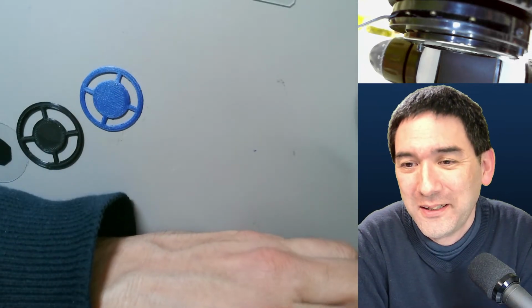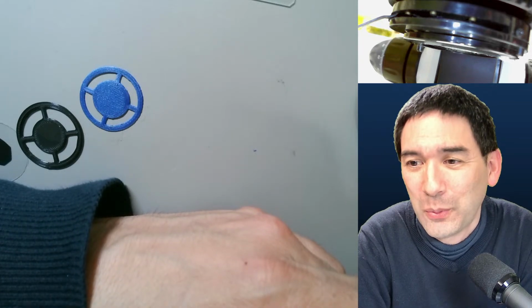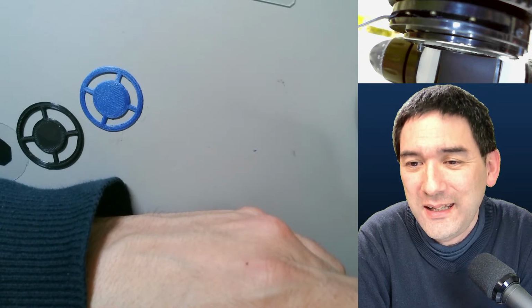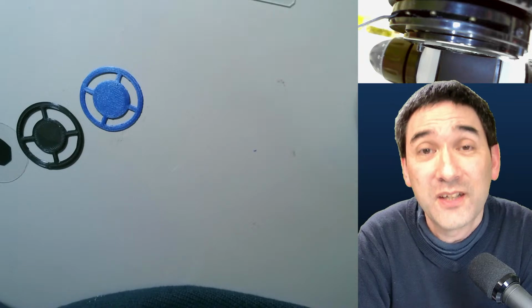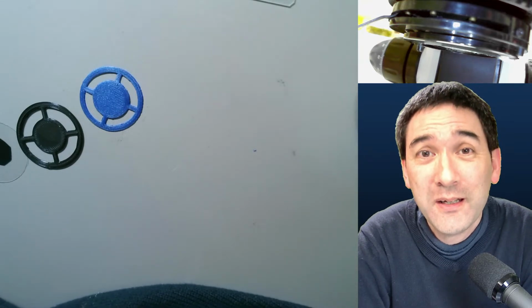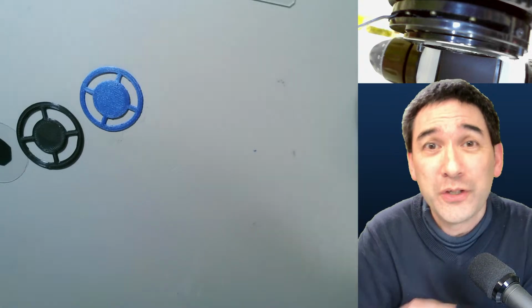Lawrence says the following: I was looking at plant cell walls the other day, and I can see things moving when I zoom in close. My question is how do you know if the tiny things are alive or if it's the random Brownian motion? Generally, if it is random Brownian motion, then it's really random.